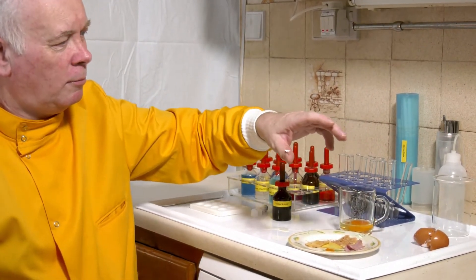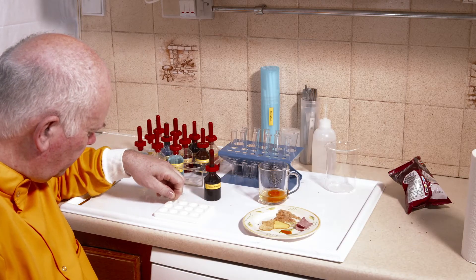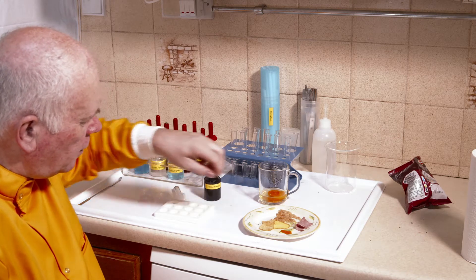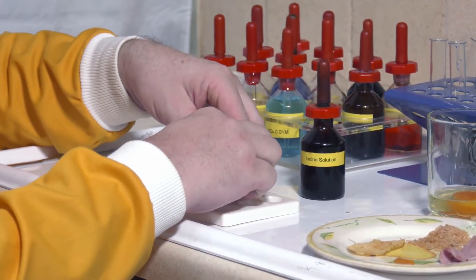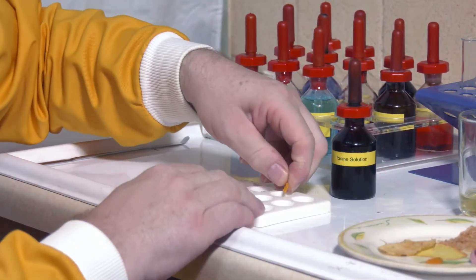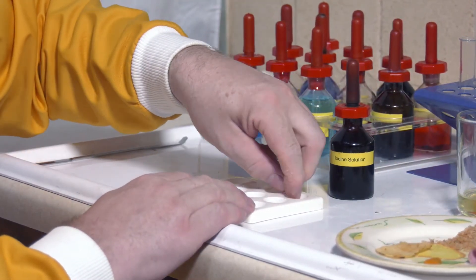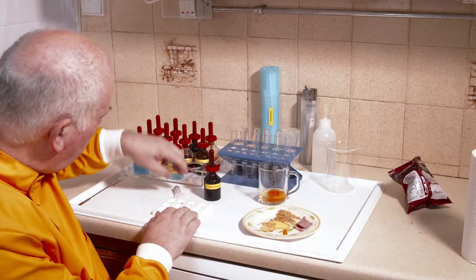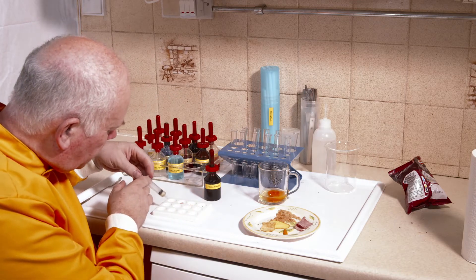Let's have a go and see what I can do. For the starch test with iodine, I'm going to take a small amount of bread — just some crust — a small amount of meat, a tiny amount of Red Leicester cheese, a bit of crisp, and for the egg I'll use a syringe because it's extremely messy and gooey.